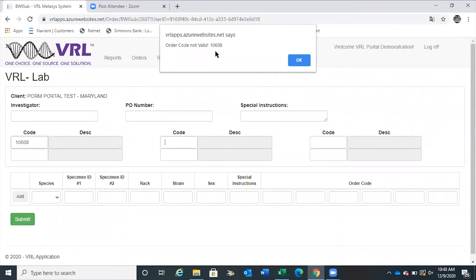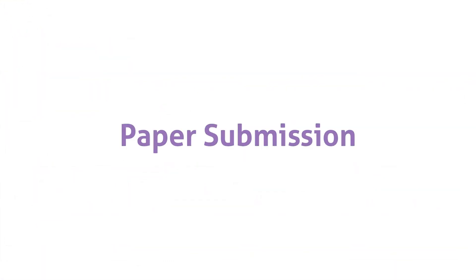If you believe you received an error code by mistake, such as a custom panel that we have given you a specific code for, please call us so that we can input it into the system and verify that everything is correct.